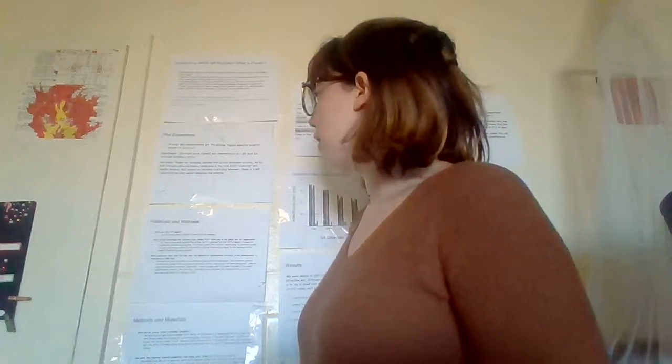For the experiment, we were testing the question of at what salt concentration trypsin will show the greatest amount of activity. Our hypothesis was that there will be an optimum salt concentration at 1.2, which will show the highest amount of enzyme activity. Our rationale was that there are external factors that affect molecular activity. As the salt concentration increases, the molecules will start moving around and there will be an increase in activity. But we also knew that there was a salt concentration at which the enzyme would denature, so there would be an optimum, and then the activity would drop off.